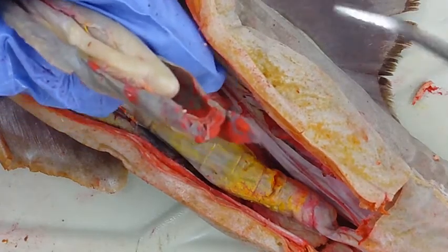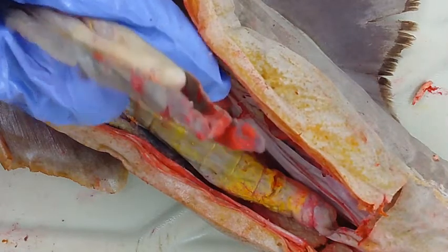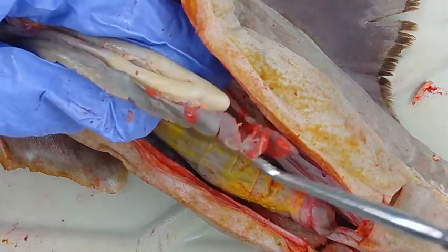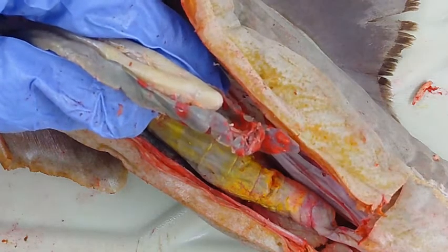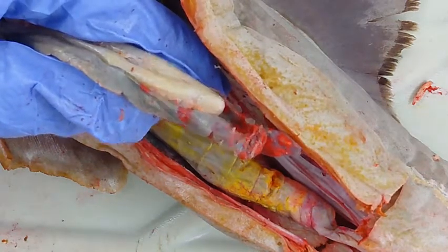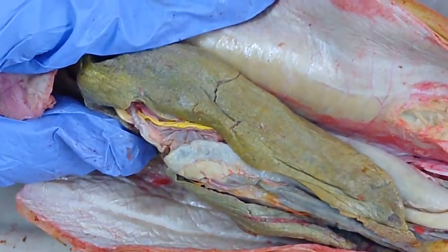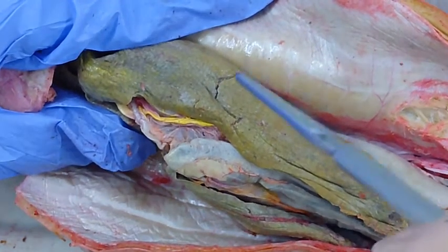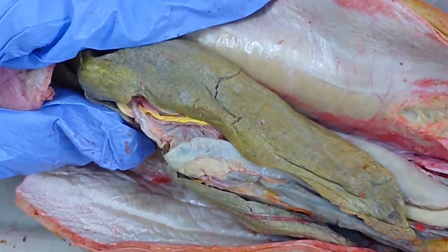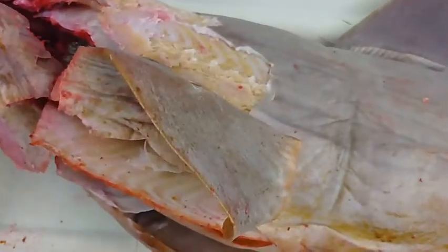And then we have the spleen, which is a large gray organ and is a lymphoid tissue, which is important to production, storage, and destruction of erythrocytes. In relating to how the mode of locomotion and ecological niche is for a shark, we know that the liver is advantageous for aquatic vertebrates because it reduces its density and approaches neutral buoyancy. They store oils in the liver to reduce their body density.